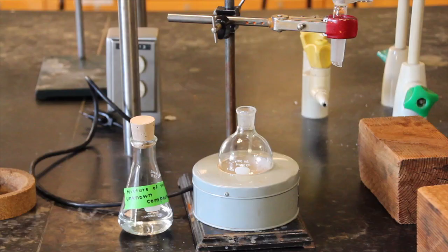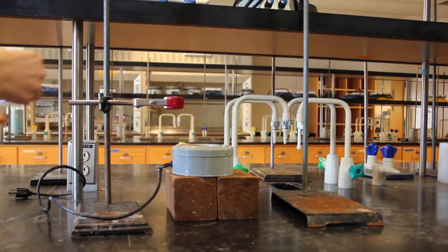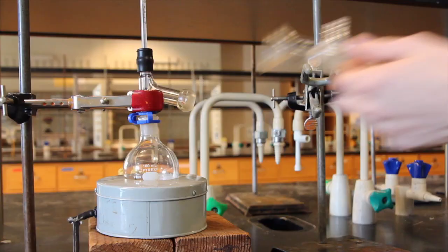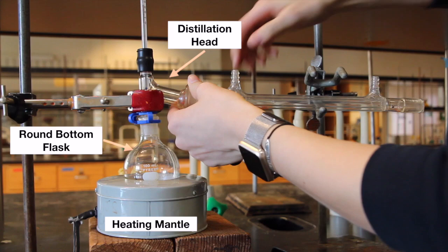You will work in groups of three or four with you and your partners working on the same unknown mixture. Each member of the group will perform a separate distillation. At least two members should set up and perform a fractional distillation, others can perform simple distillations. The major difference between the two types of distillations is the setup and glassware involved. Other differences arise from the effect that the different setups have on the quality of separation.